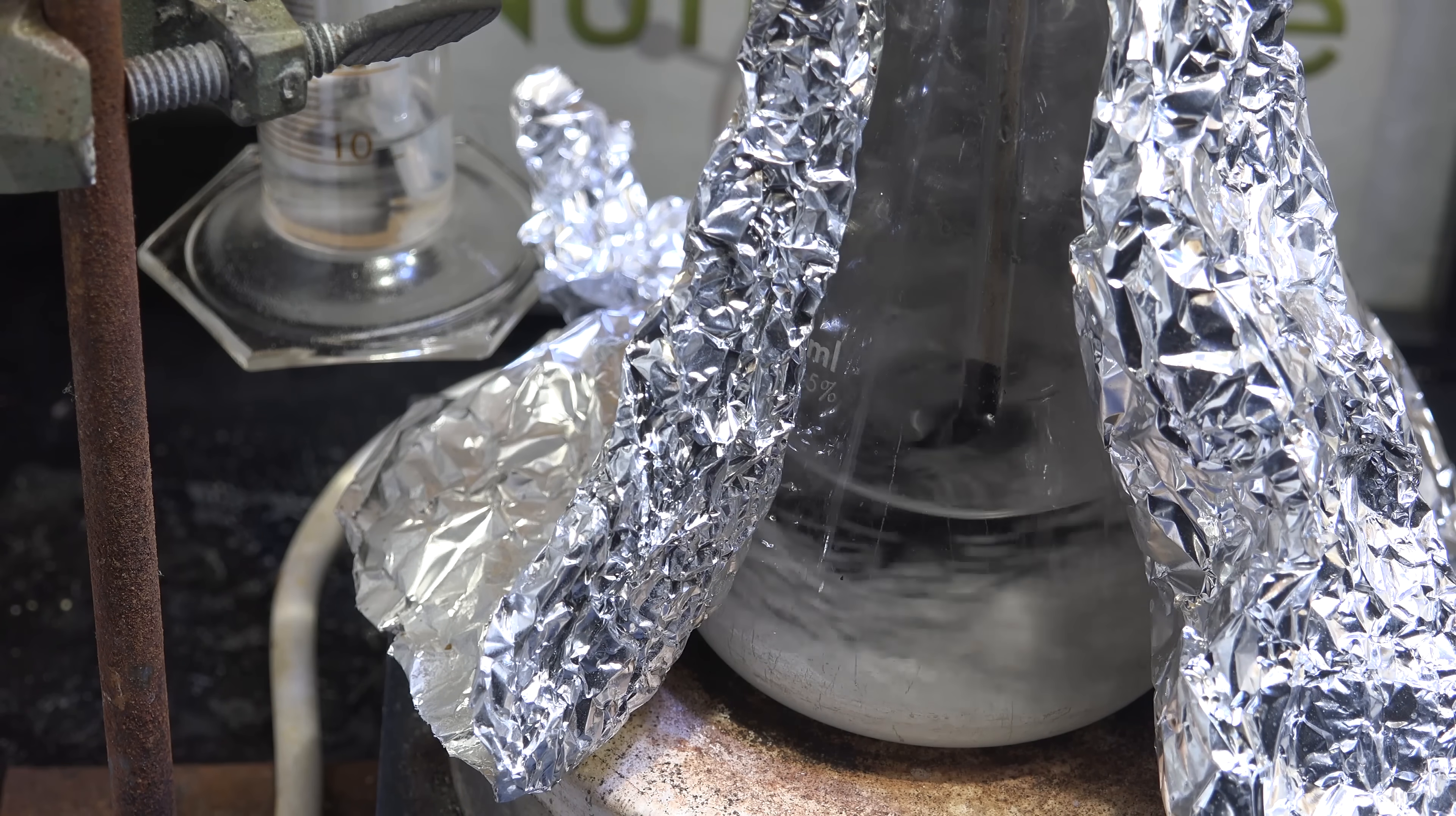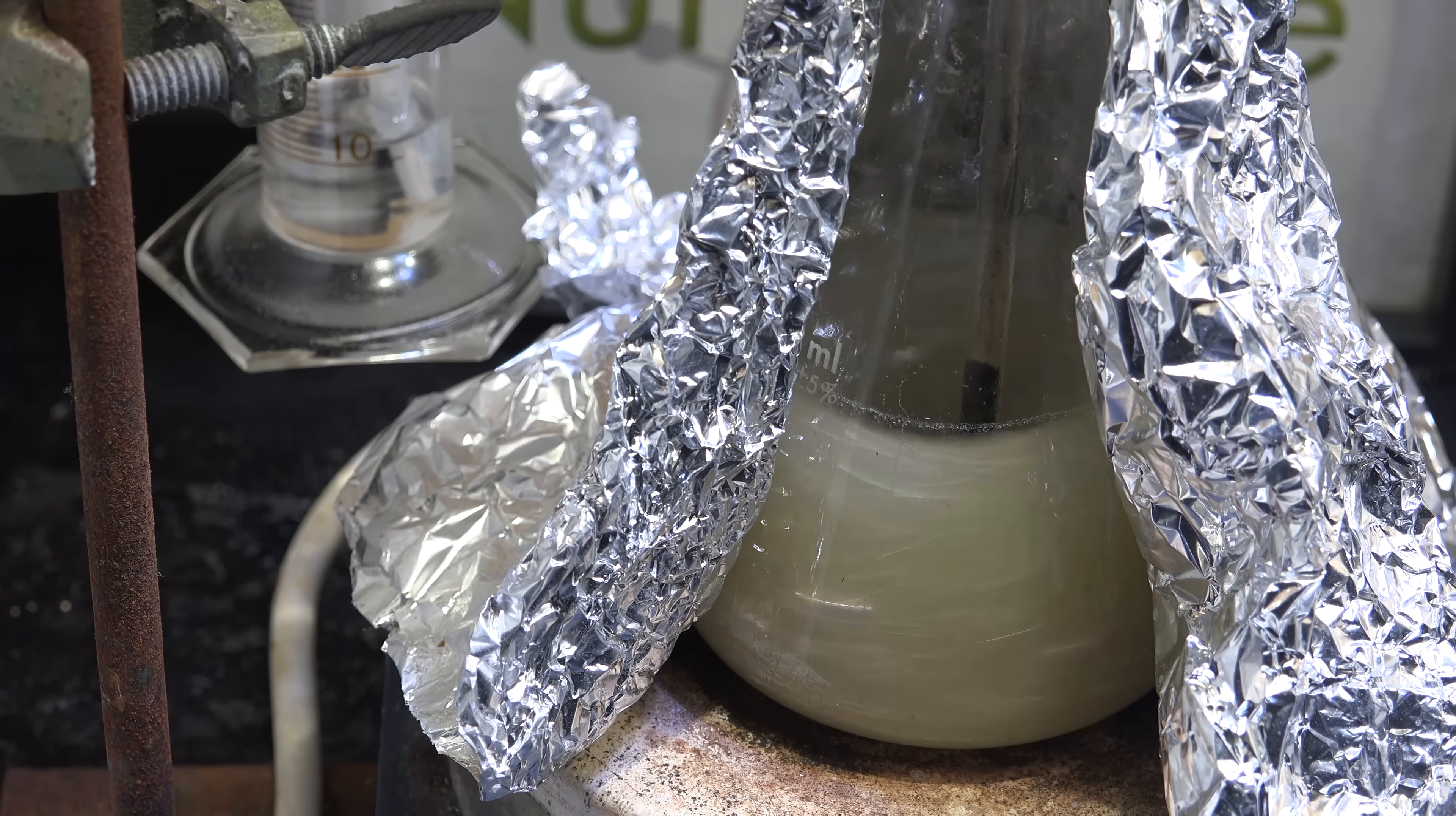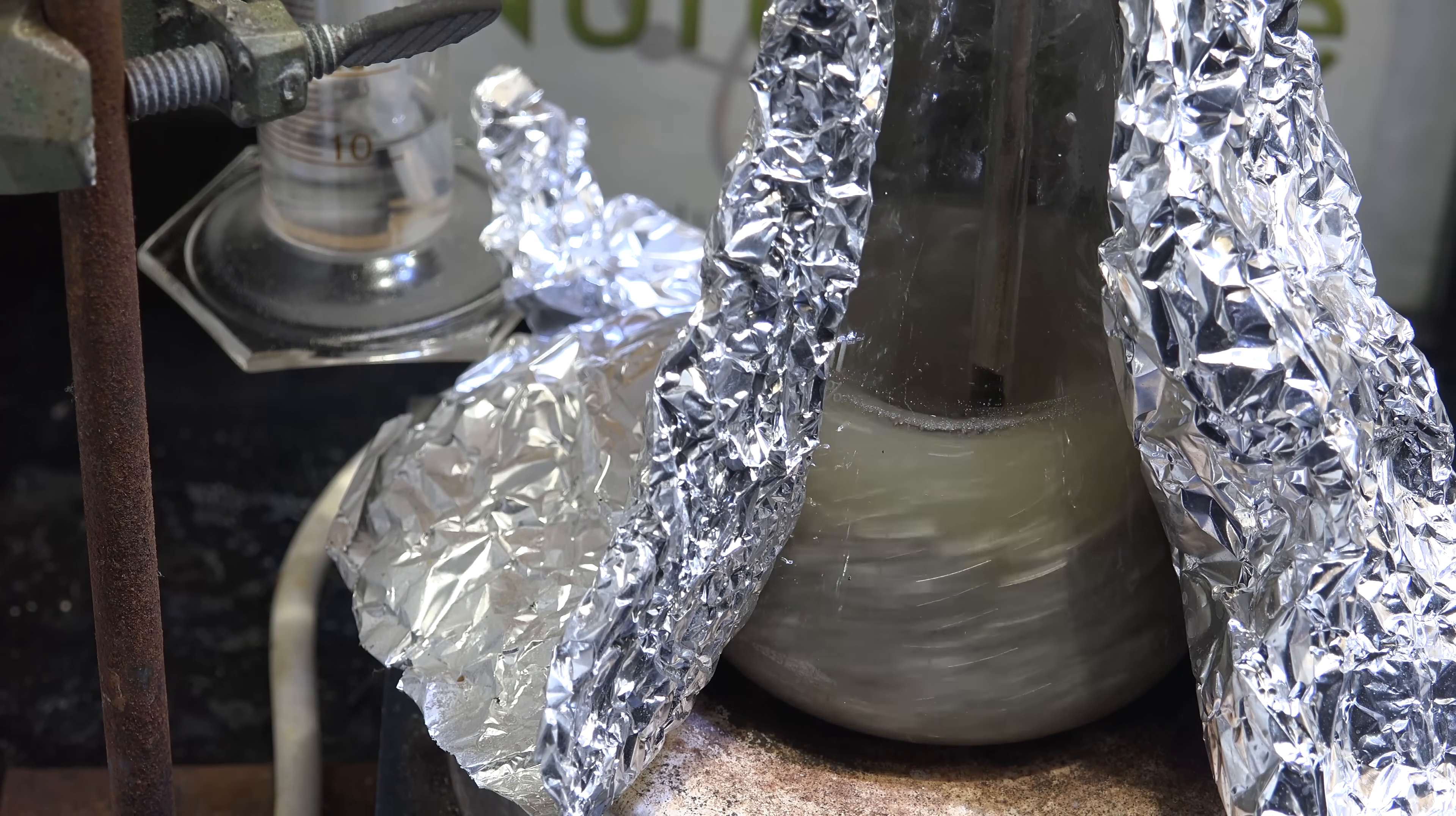First we do the drying step as usual with tea tree oil, heat to 125 Celsius until the bubbling stops. Then we add in magnesium metal and heat to 200 Celsius and it looks like it's working.